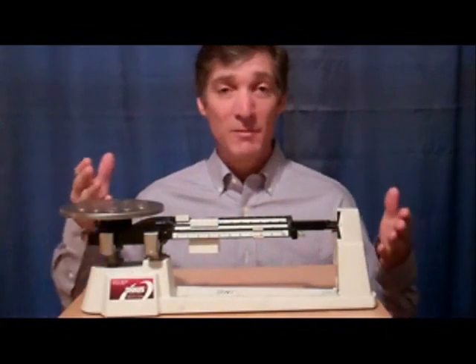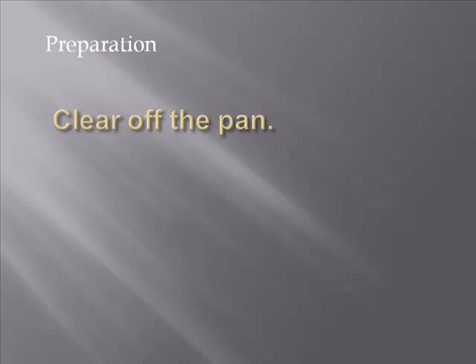This video instructs how to set up and operate a triple beam balance. Before beginning, the triple beam balance needs to be placed on a level surface.